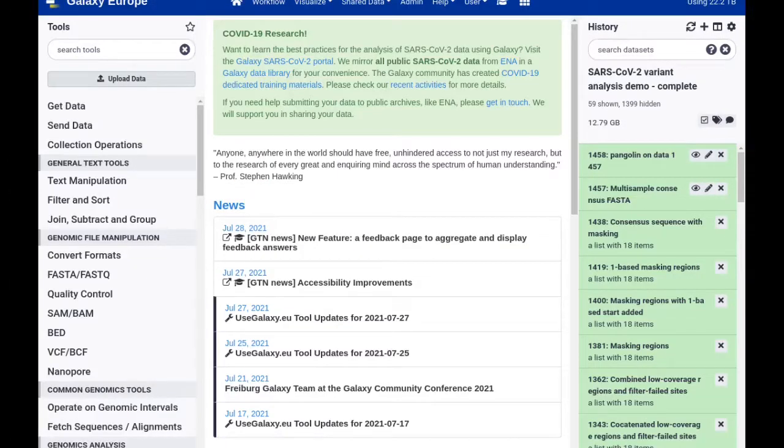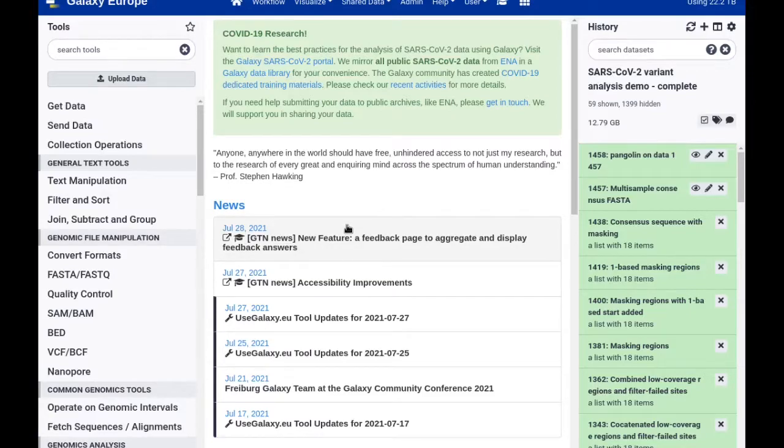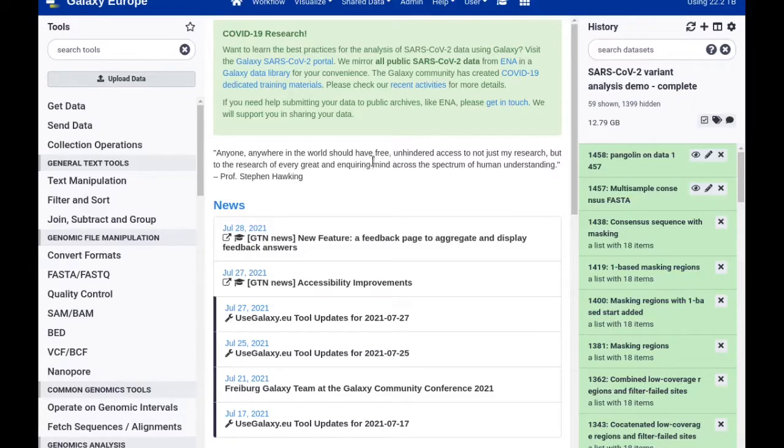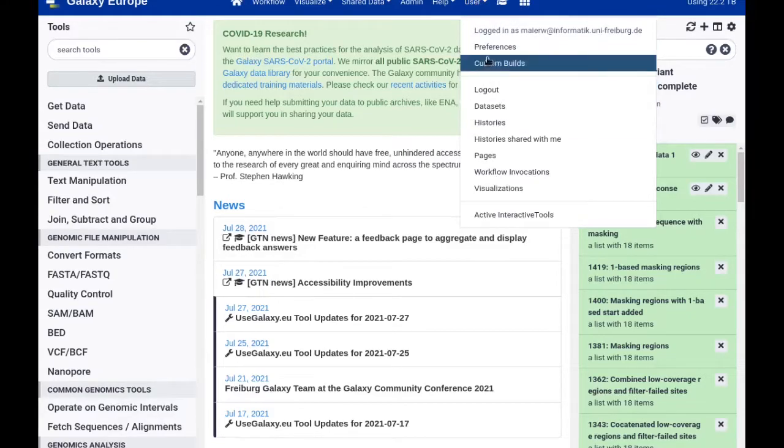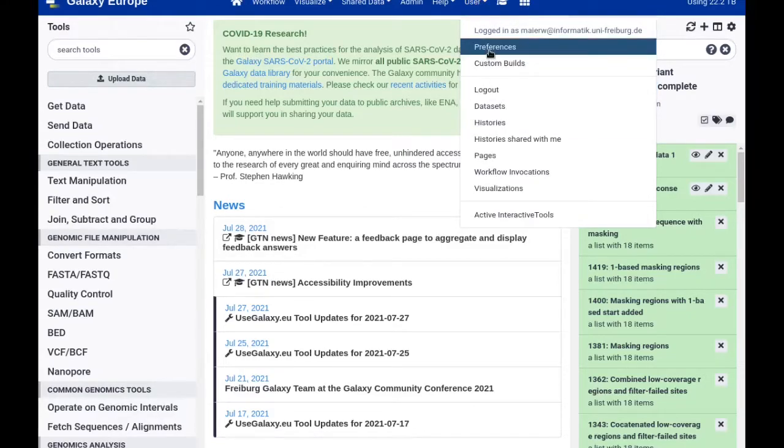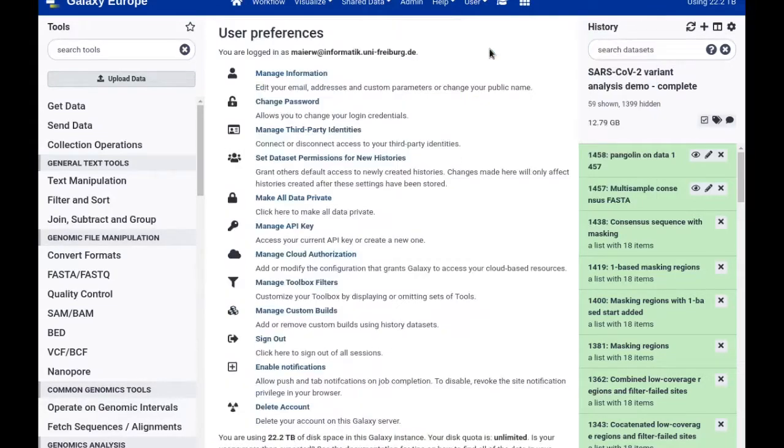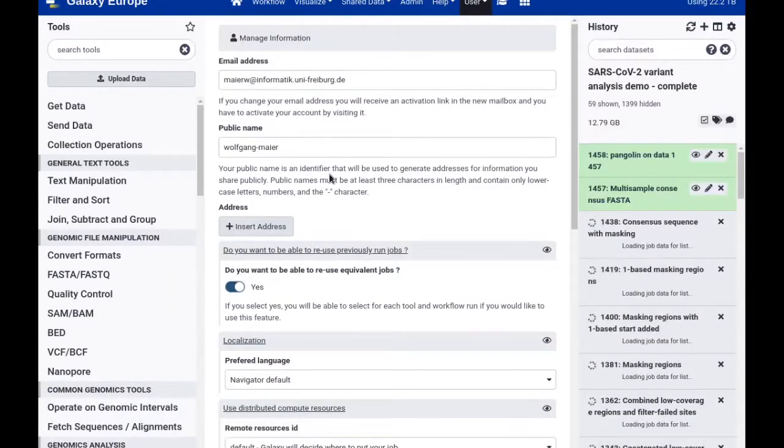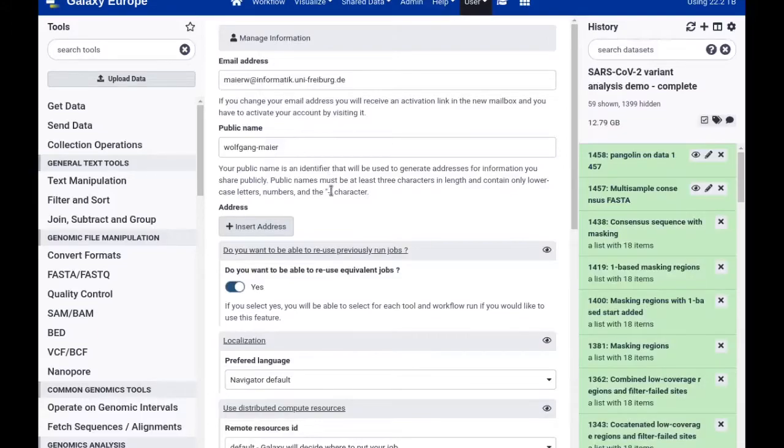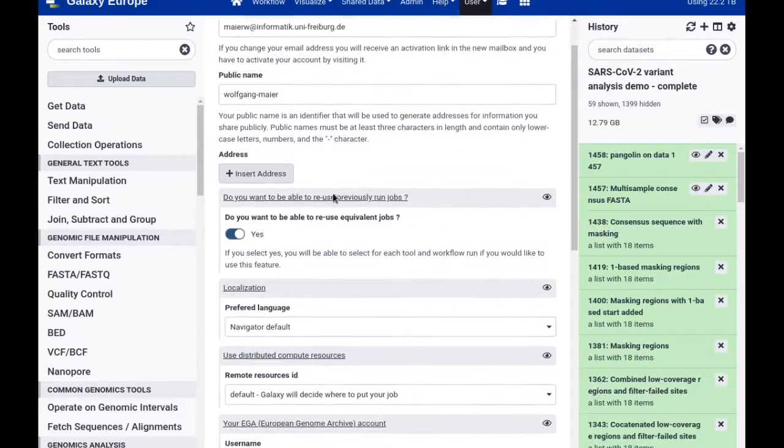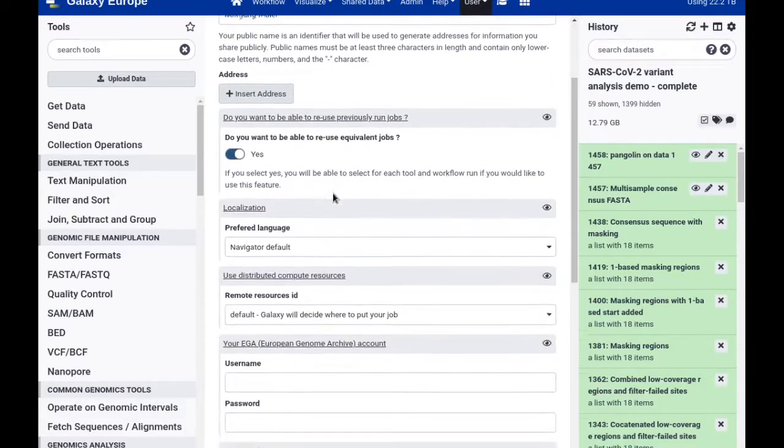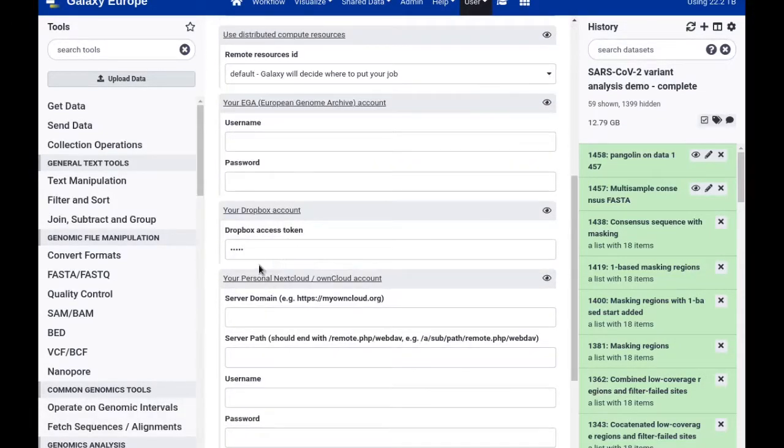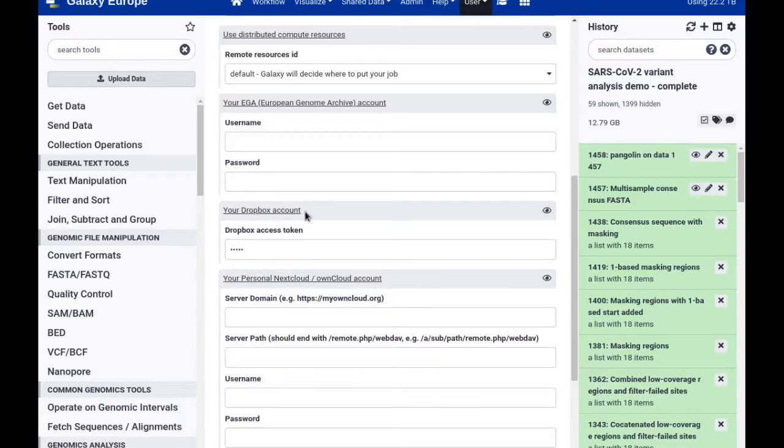In both of these situations, connecting your Galaxy user account to a data store is the answer. To set this up, go to user preferences, then manage information, and on that page scroll down about halfway. You will find the option to connect Galaxy to either your Dropbox account or alternatively to your personal Nextcloud or OwnCloud account.